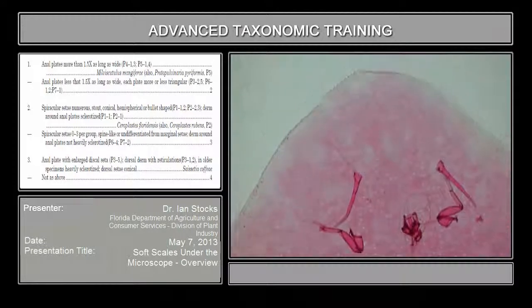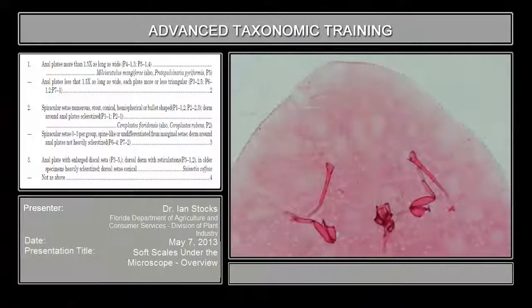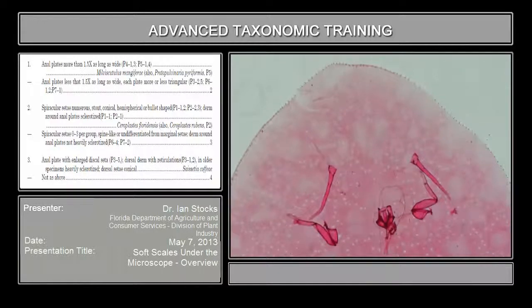So go ahead and get the slide set up so you've got it on the 10x. Okay, so you've got roughly the head area in view. So the front margin all the way down to where the antennae, the first pair of legs, and the mouth parts originate. All right, so we're all set up with that at around 10x.